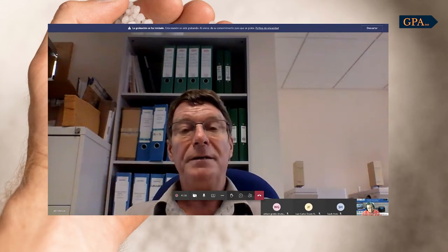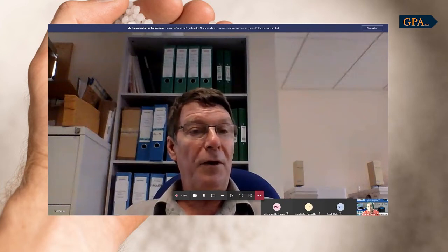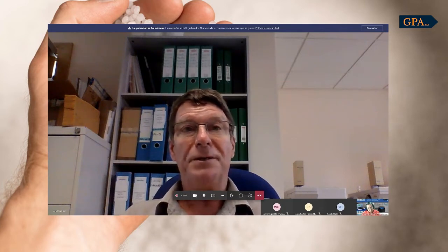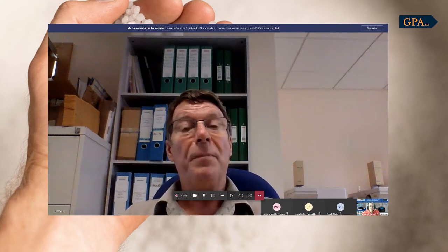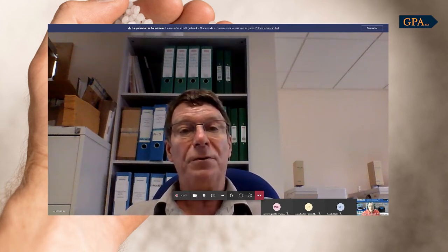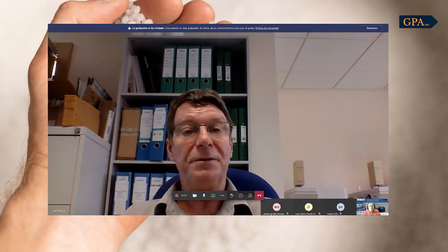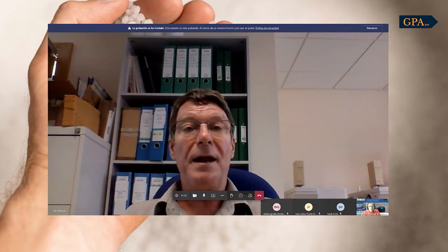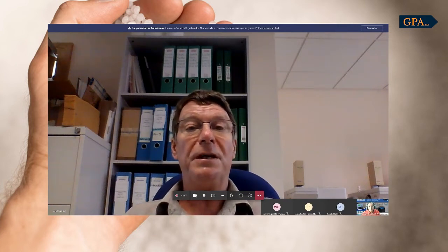And as I said, if you had a laboratory full of proper research quality instrumentation, you'd have to do a lot of measurements to make sure that that material was what you thought it was. But because we already have a stored reference set, all we have to do is match that material to the reference set, and one simple test will tell us unambiguously that that's what the material is.